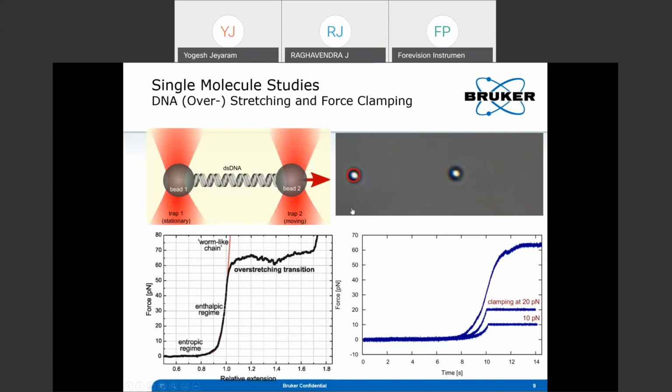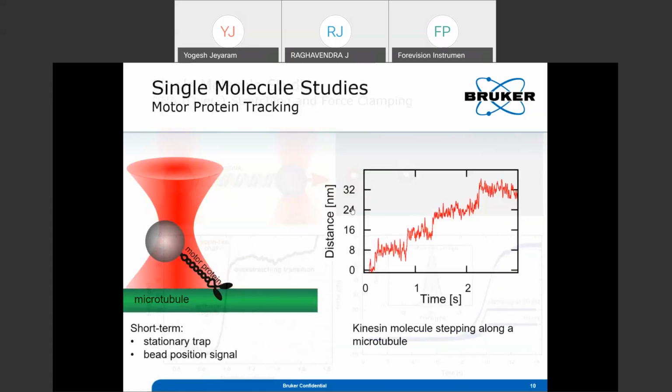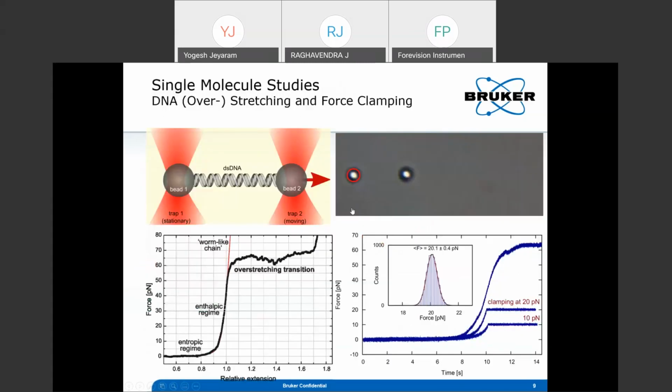And this is happening in our bodies as well. It's one of the mechanisms. Force or mechanical stimuli is one way that certain reactions are turned on or off, right? So you put your molecule in stress or relax, you will trigger certain kinds of reactions in your body and maybe some immune responses as well. So that's one way people use to study, right? And because you have super controls with force, like sub-piconewton force control, you can comfortably do that without the force getting drifted away. Yeah. Okay. So you can see here the force control is less than 0.5 piconewtons, right? So excellent force control that we can get.